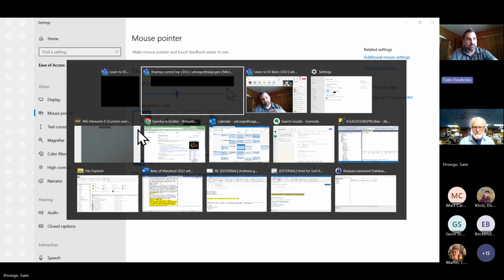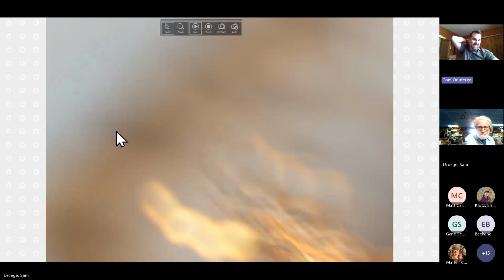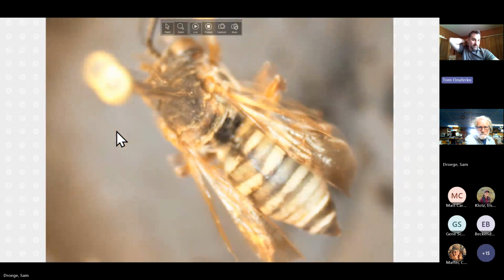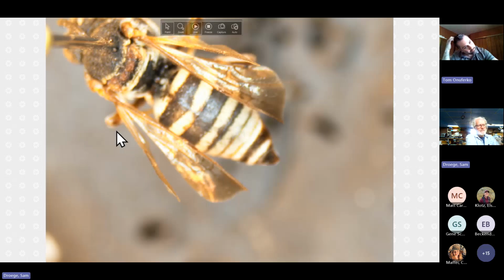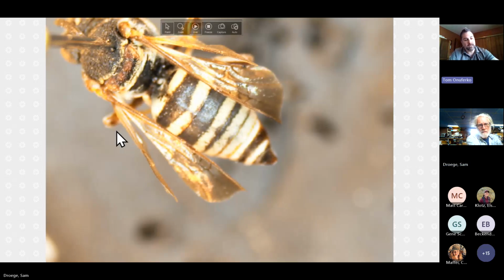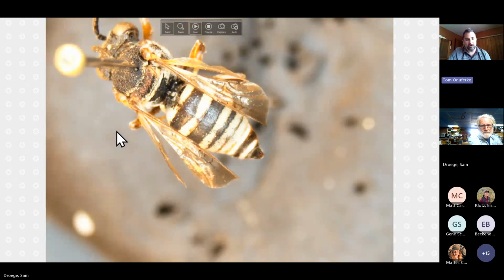When we started to put together the Discover Life equivalent, there will be female and male versions of the key. They'll largely be the same, but for those who are more used to keying using sex-specific keys, they'll have that available in that format. But the key that I'm going through today will work for both sexes.